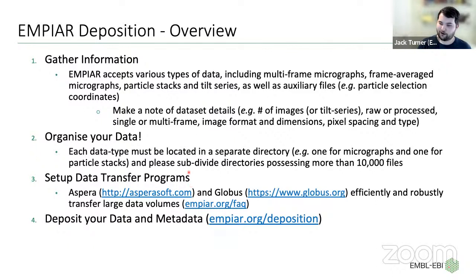Set up your data transfer programs. So this is just a matter of downloading the client of choice. I think Globus is probably the preferred software, but Aspera is also fine. And then finally, get on with depositing your data, which is what we've just gone through there.